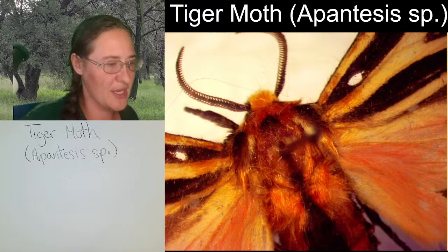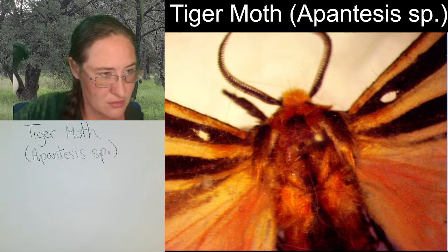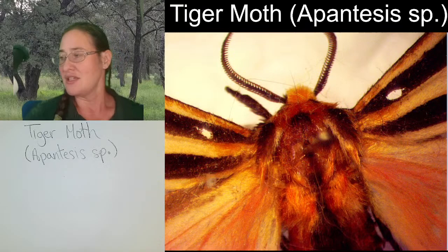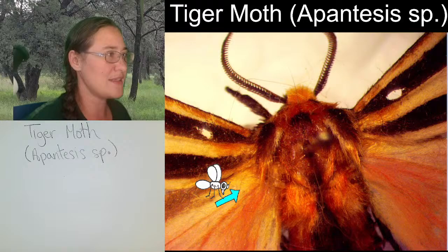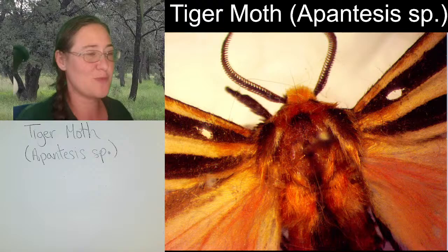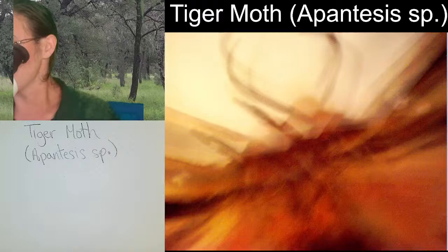Alrighty, so we're going to go ahead and switch back over to the live camera rather than that picture. Something that you will notice on this specimen is, because I collected it so many years ago, I was not all the way used to spreading moths yet, so you will notice those white spots right here and here through the front wings, and you might even see the holes on the hind wings too. They're going to be a little bit further out, I think. When I was spreading this moth, I probably put a pin that was a little bit too big through the wings, but it was a learning experience, and I am happy that I started somewhere.